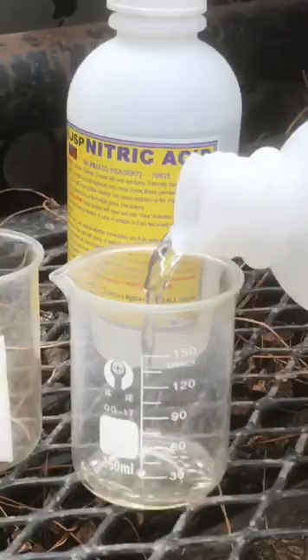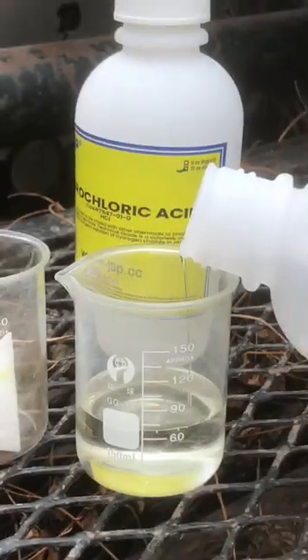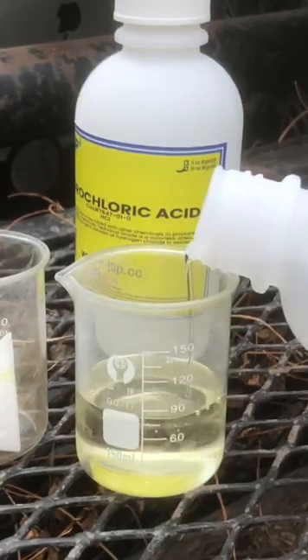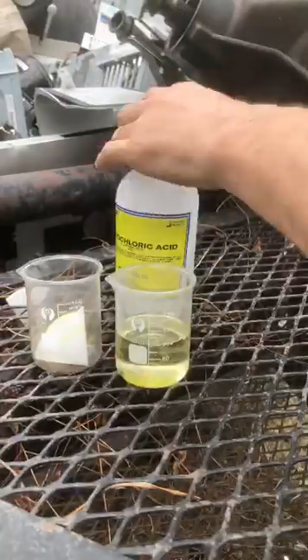Let's refine some gold into 24 karat gold. To do this you're gonna need three parts hydrochloric acid, one part nitric acid, and some beakers. In this video I will refine some refined gold mud and some gold flakes.